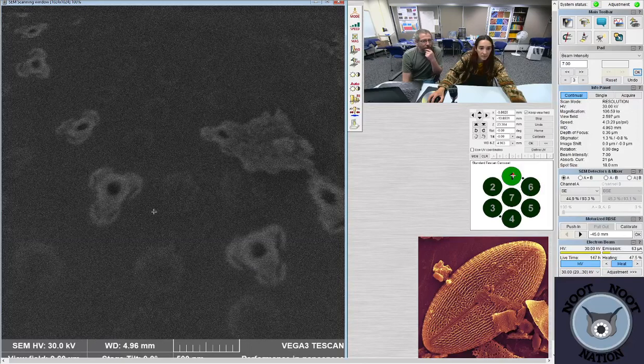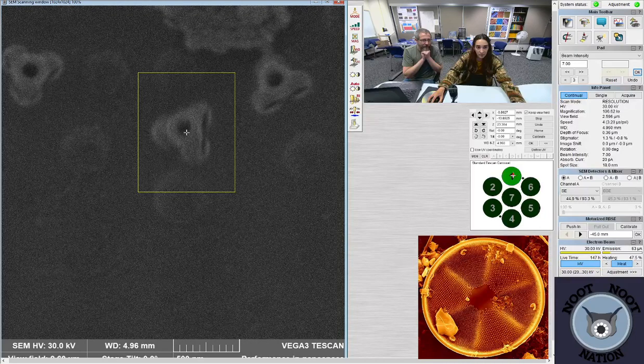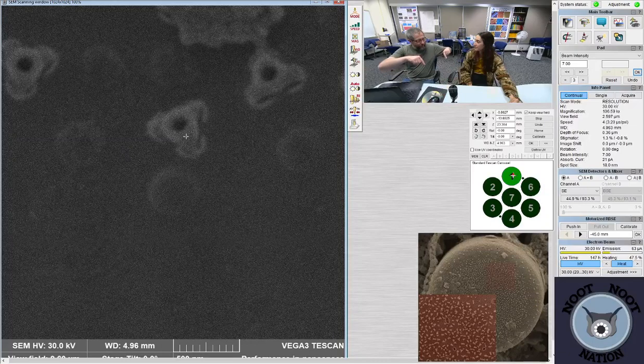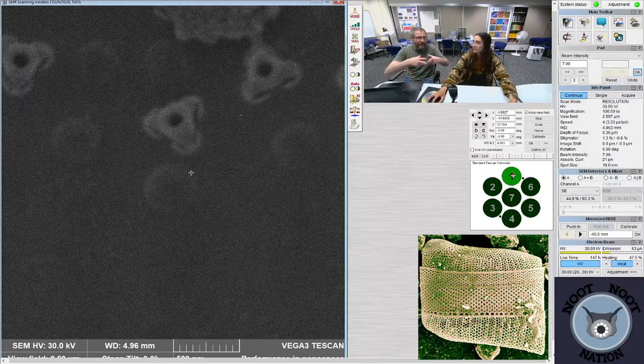And so it's maybe not perfectly clear, but what's going on there is there's a triangle-shaped sort of platform that's sticking out from the ring. So the central pore is where you have your cursor now. I'll let you focus it because it's just a little out of focus. Oh, it's so sharp. I think maybe it needs to have the stigmation fixed a little. But there's a central hole, and then around it there are these little sort of curved arcs in triangular shapes. And covering over those is the little pointed triangle pore cover right there. There's an edge of that that's sticking out covering over each one of those. And there's actually a little tiny pore underneath that cover in each case.